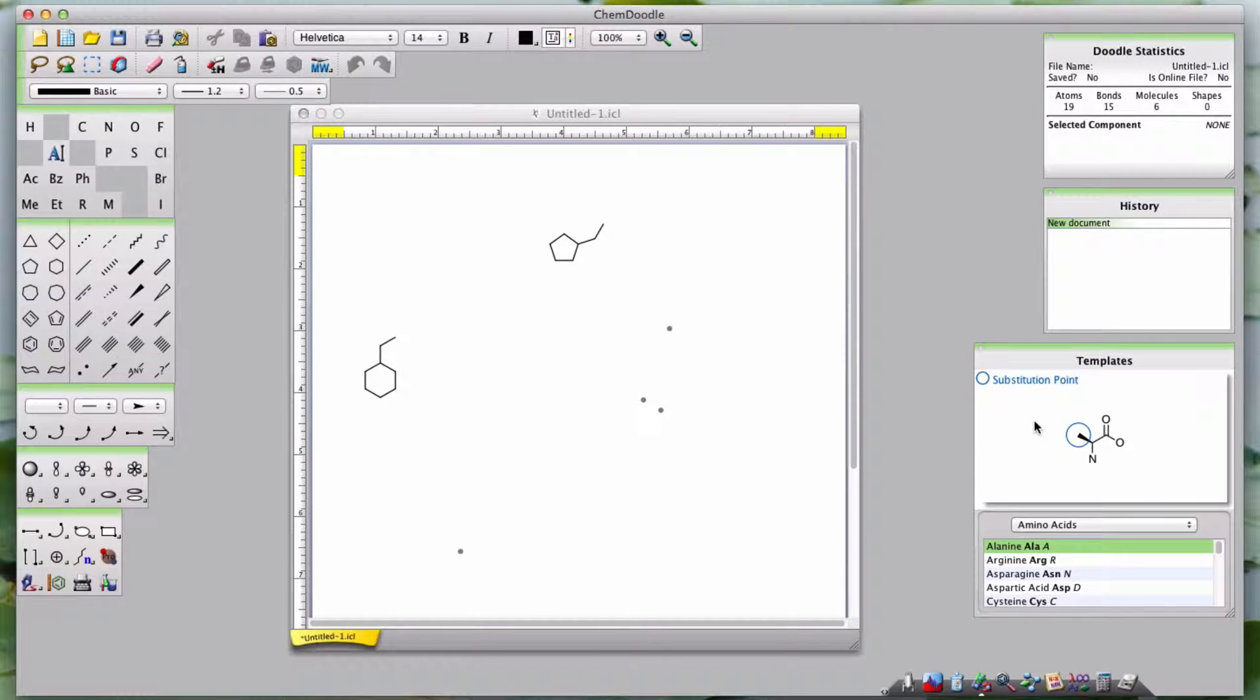At the top of the Template Widget is the Main Structure Panel. The Main Structure Panel displays the currently selected template. In the top left corner, a blue circle with the words Substitution Point indicates that whatever atom the blue circle appears on is the Substitution Point.